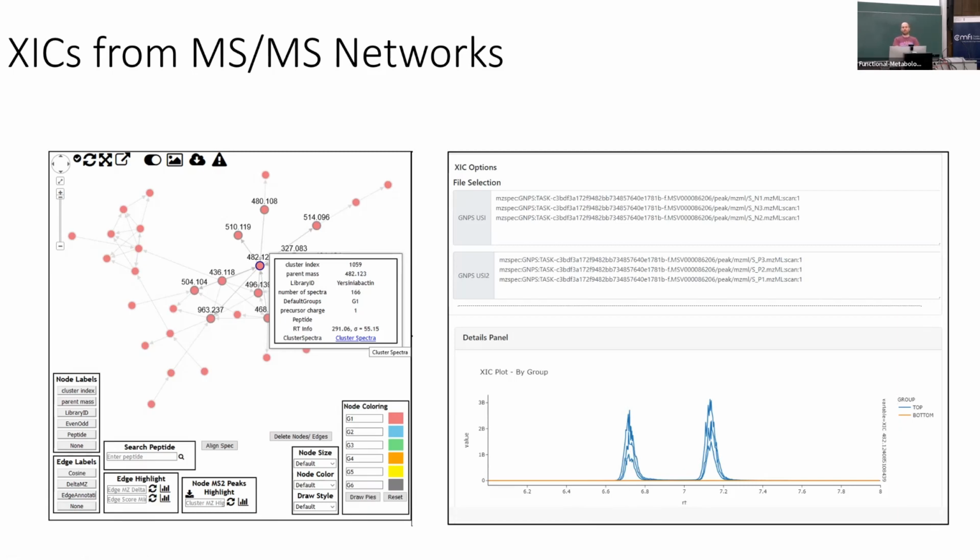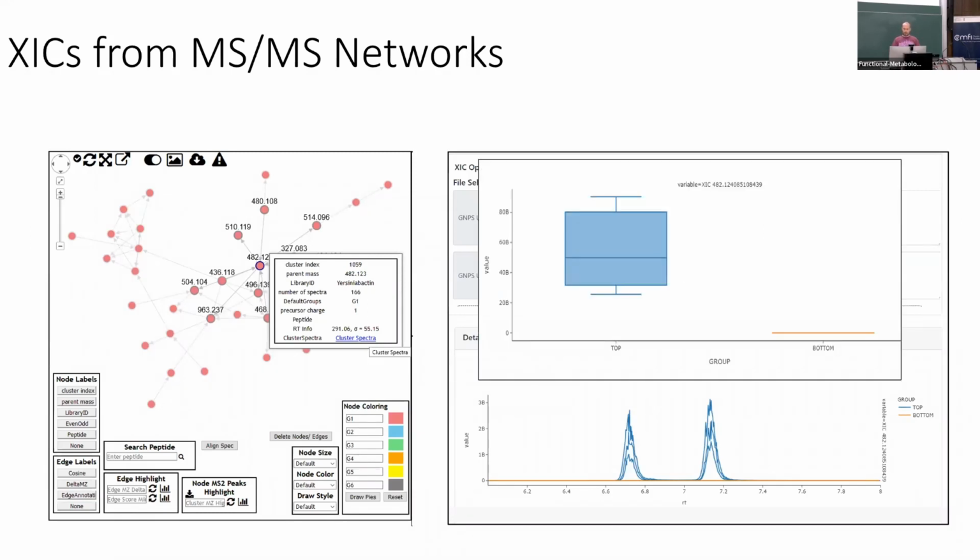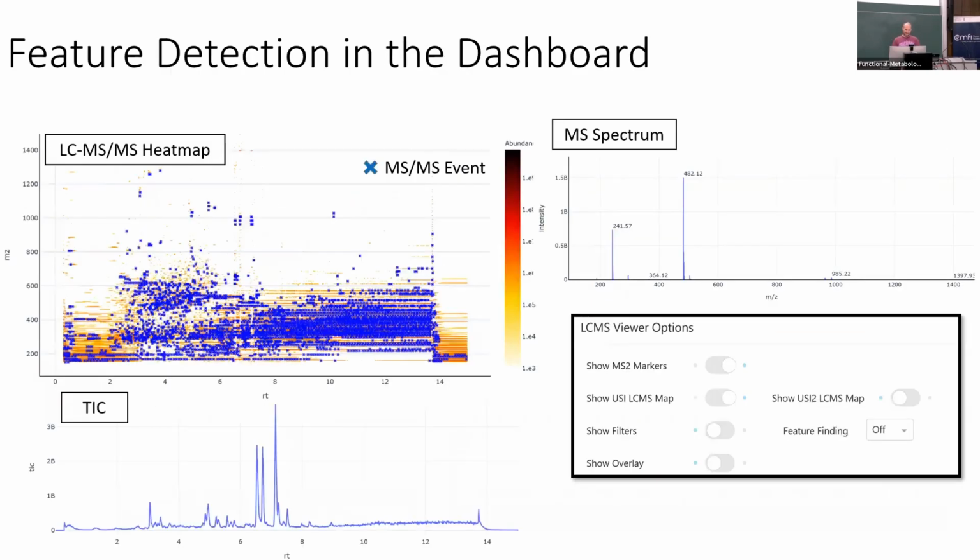So we had a very simple question here because we knocked out a gene cluster and we wanted to ask, okay, is that molecule actually produced by that gene cluster? Okay, then the NRPS was knocked out, so then we don't see it. So, well, likely that was the case. I can go down and directly visualize this for you as a box plot, so you get an idea if the difference would be a little bit more subtle. I guess here it was very clear.